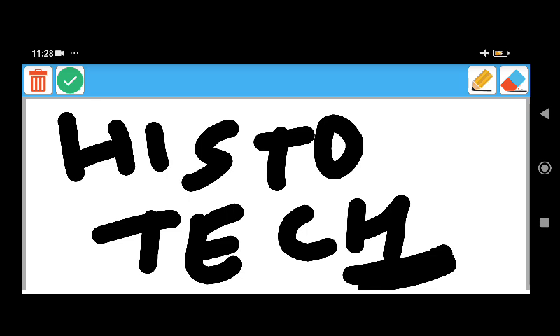In infiltration and embedding, the medium must fill all the spaces within the tissue to support the cellular components during microtomy. The density of the medium should approach that of the densest tissue component. Low melting point paraffin wax is the most commonly used for impregnation, whereas a high melting point paraffin is used for embedding.